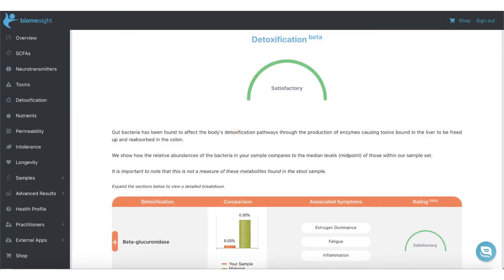In the detoxification section, we cover bacteria that affect detoxification pathways. We specifically include beta-glucuronidase, which directly affects hormonal balance and inflammation.